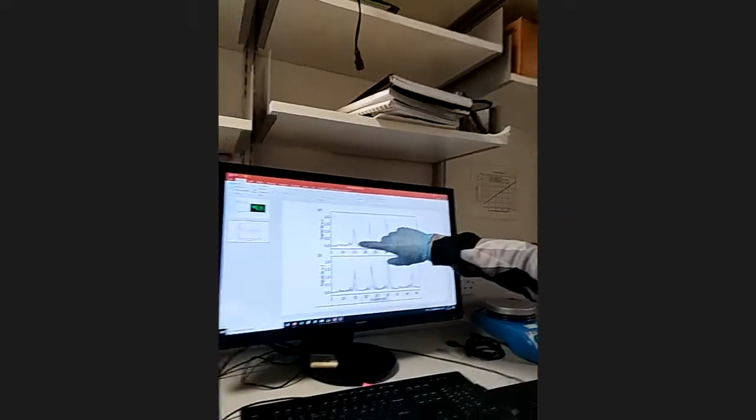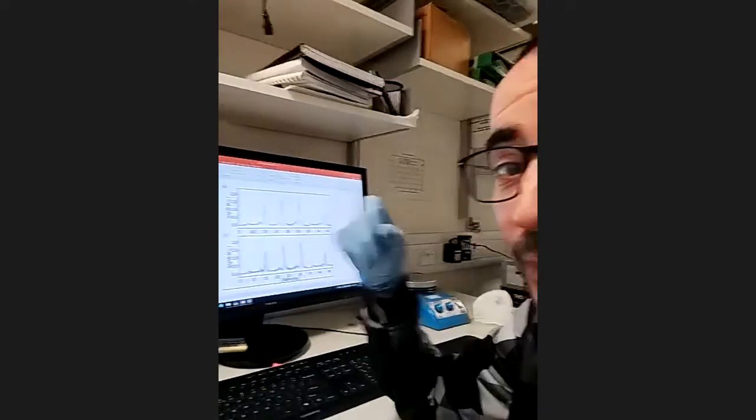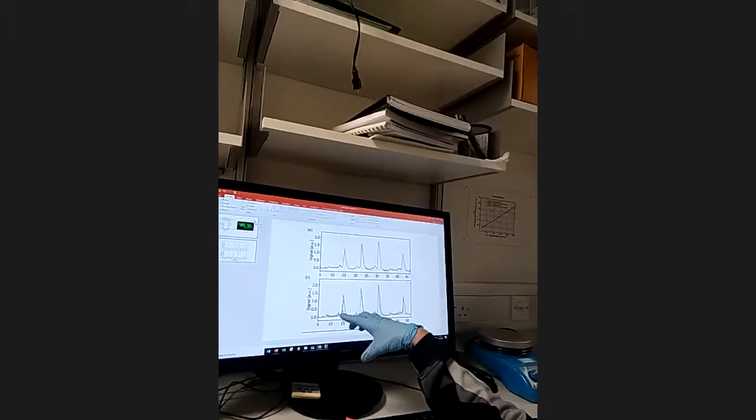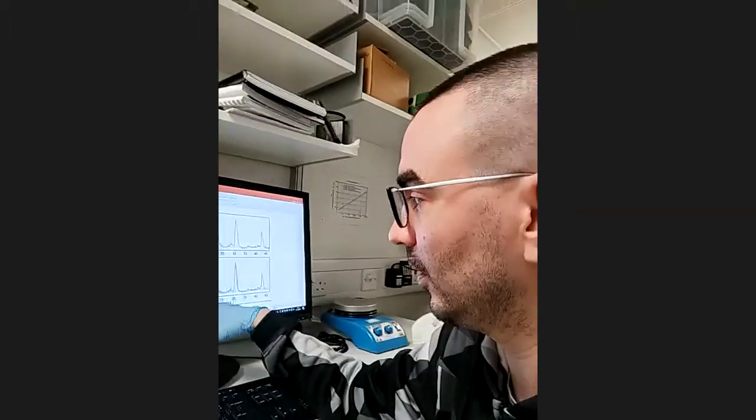And normally a chromatography detector only measures the absorbance: you throw light at the samples as they're transiting through the detector, and if it blocks the light, that's absorbance, and you only get one piece of information. But by getting the fluorescence lifetime, we can extract a different piece of information, to tell which different proteins are eluting, coming off the chromatography system at the same time. So we're building new instrumentation that doesn't exist anywhere else, so that we can discern different proteins as they're coming off protein purification processes, which is relevant in biochemical engineering, because you're trying to produce a pure product. You want to know what things are being produced and what impurities are there.